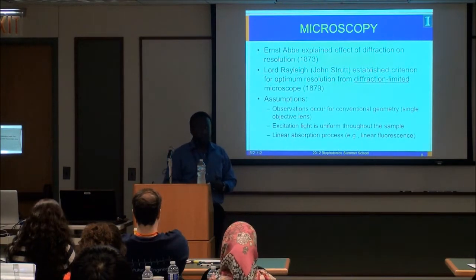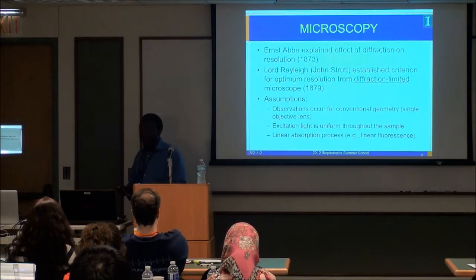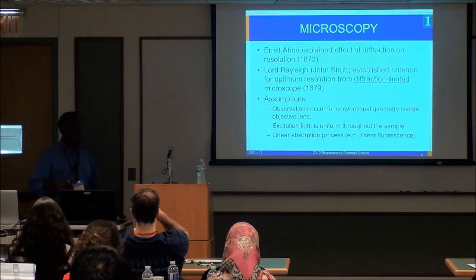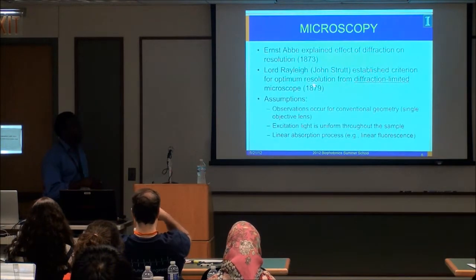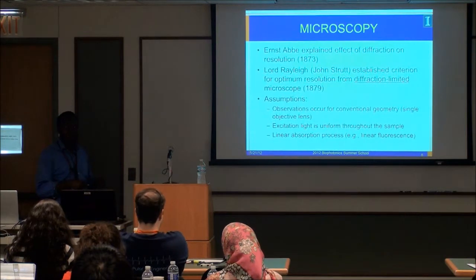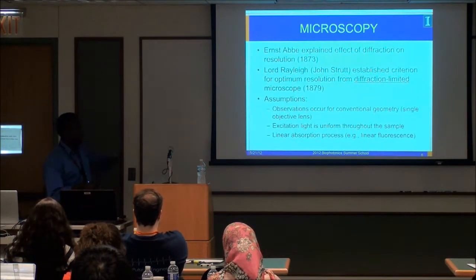We also know about something called I5M. I think people know about that. That came about by Mats Gustafsson around the same time. Rayleigh did not know about all that, right? So at the time, this is sort of the implicit assumption.